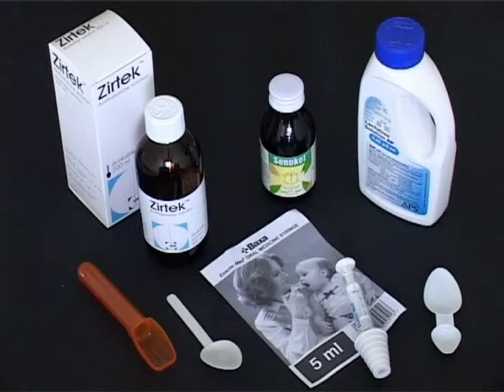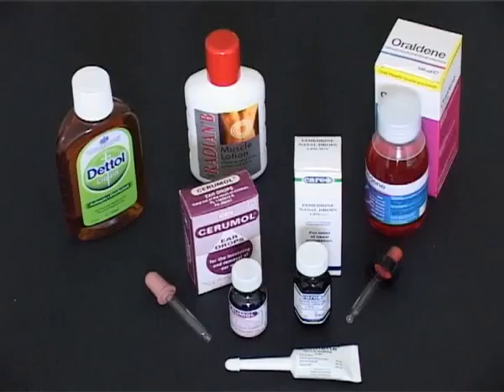When the dose is less than 5ml, an oral syringe is used. Common external solutions include mouthwashes, gargles, antiseptics, and lotions.